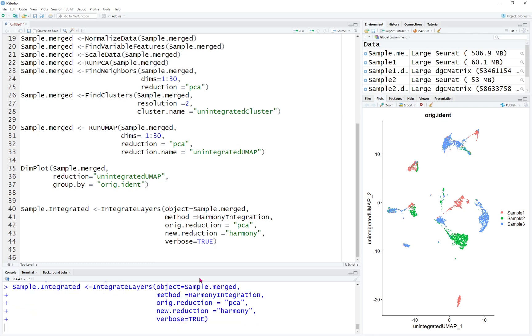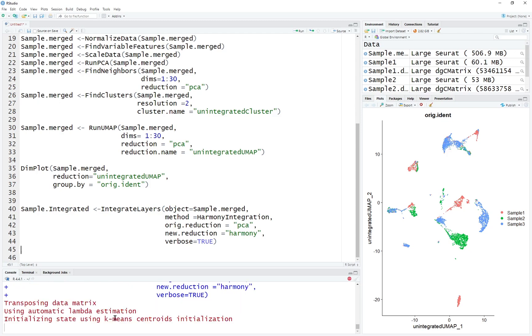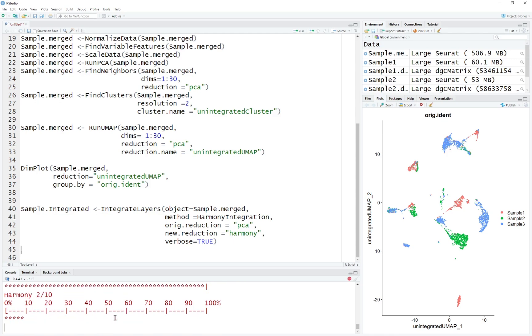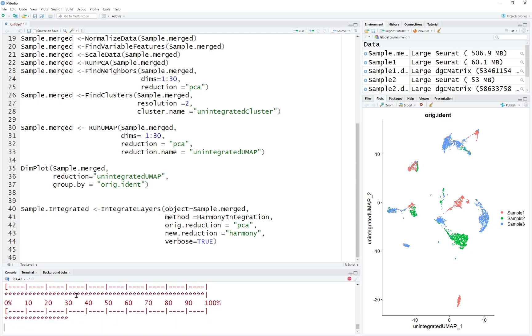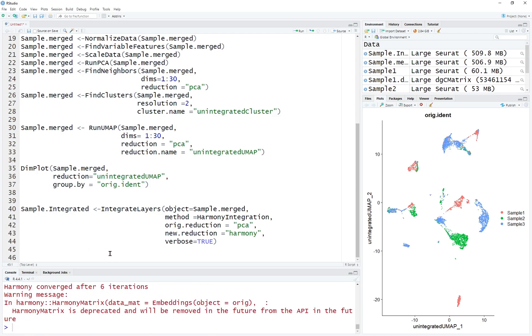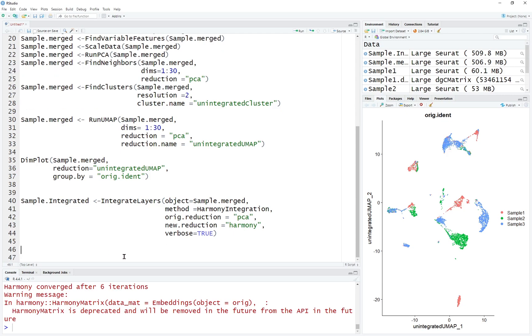Let's do this sample integration. You'll see it will potentially take some time, especially when the data is incredibly large. It depends on your dataset and your computer — whether it's super powerful or not. This could take from minutes to hours to days. This one is fairly fast — it might take just one to two minutes. Here we're using a relatively smaller sample for demonstration.